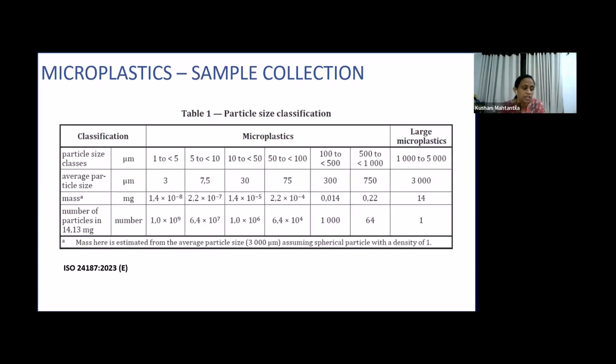Like that, the standard which is going to be introduced from next year uses the same particle size classifications for the sieves and everything, and they recommend this particle size distribution to be considered by sampling and analyzing and detecting the samples.